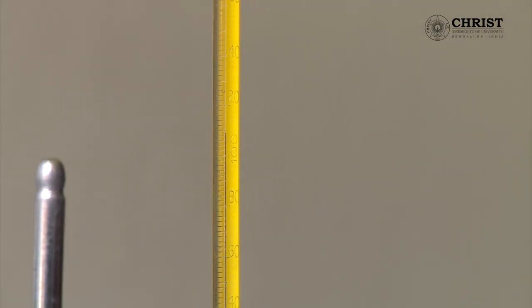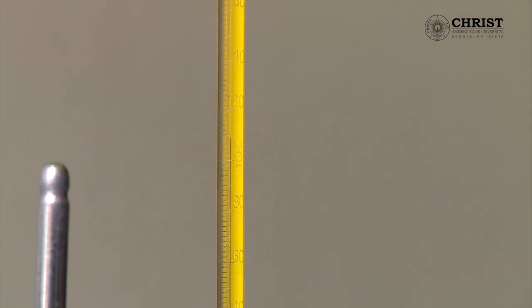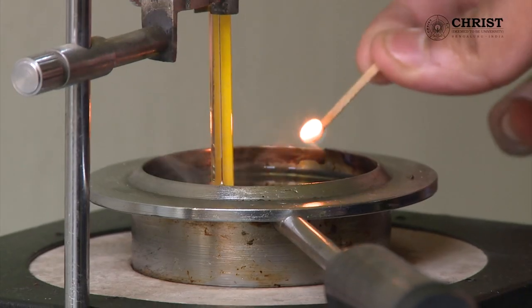As the temperature continues to rise, light the matchstick — we got a flash at 110 degrees. Now immediately check for the fire point temperature for each degree increase. As you can see, at 120 degrees no fire occurs.